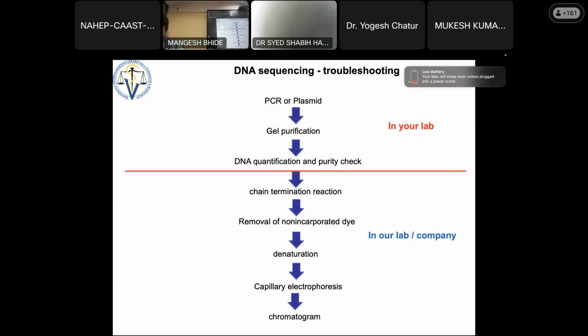And then what you need to do is have just some punching device, just punch it and put that in the column. So I will show you how to disintegrate or dismantle that column and how to put that in, and yeah, it is new again.